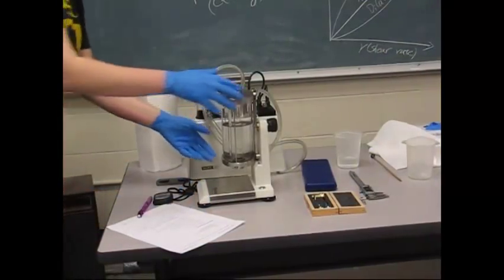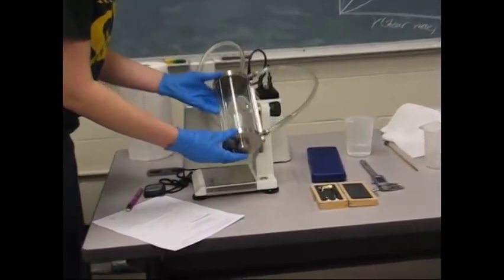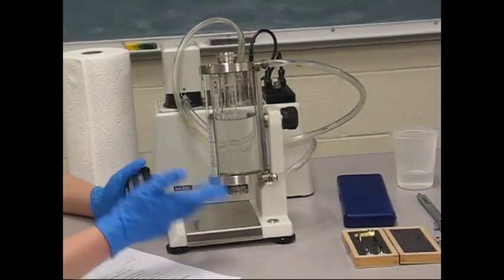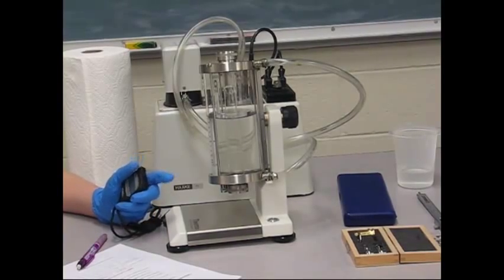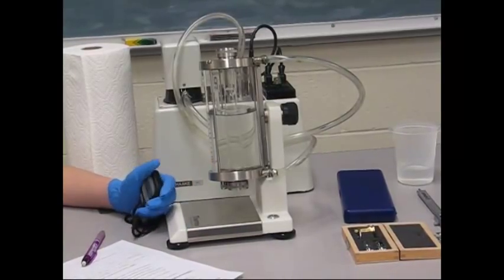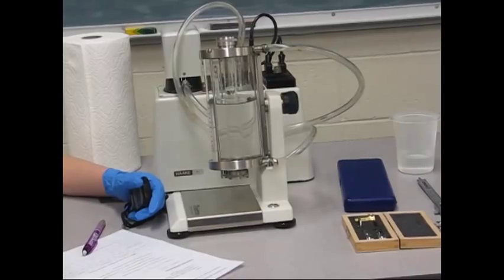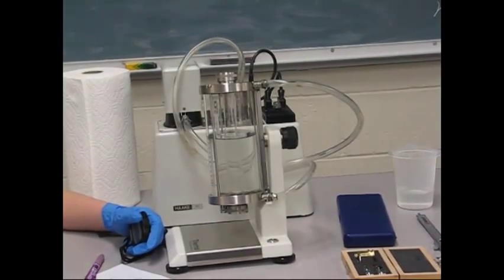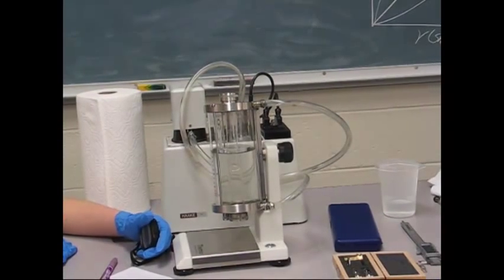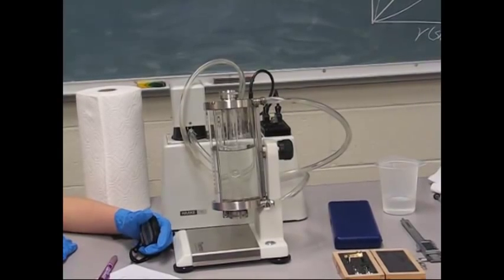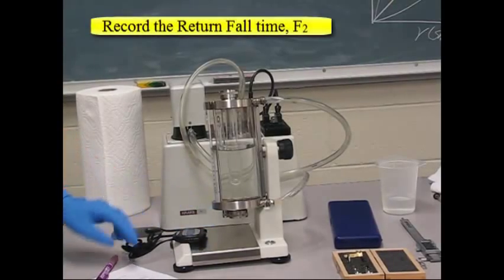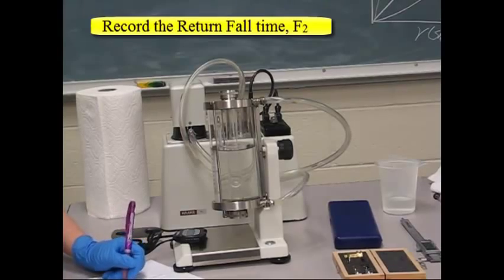Now to do the return ball, we're going to flip the ball viscometer back over and do the exact same thing. Start the timer when the ball crosses the top one and end it when the ball leaves the last line. And then we'll stop it when it crosses that line and record that value as your return fall time.